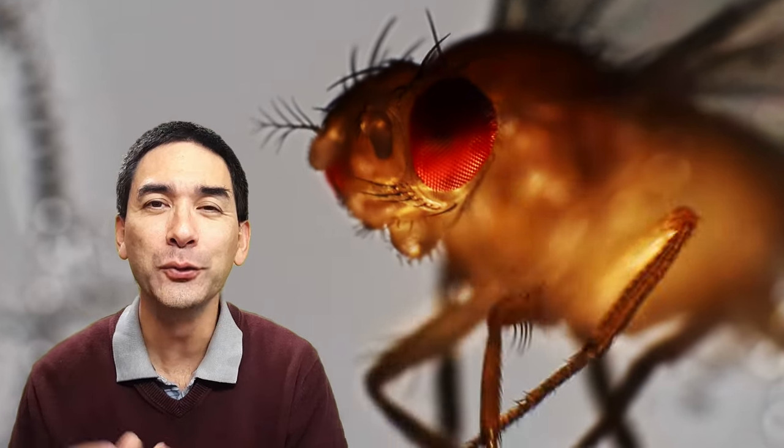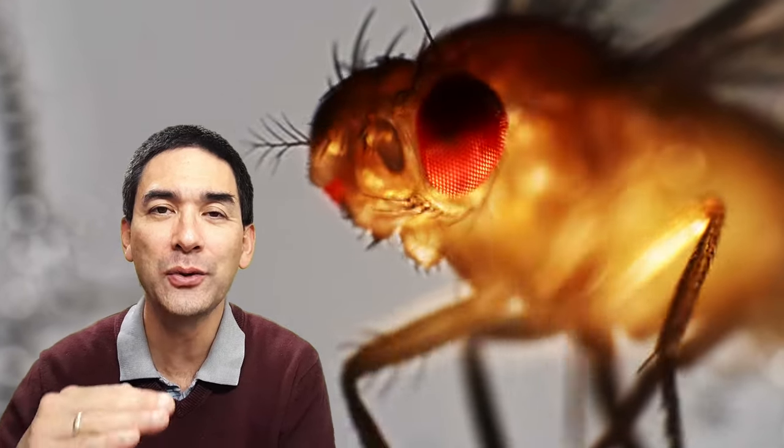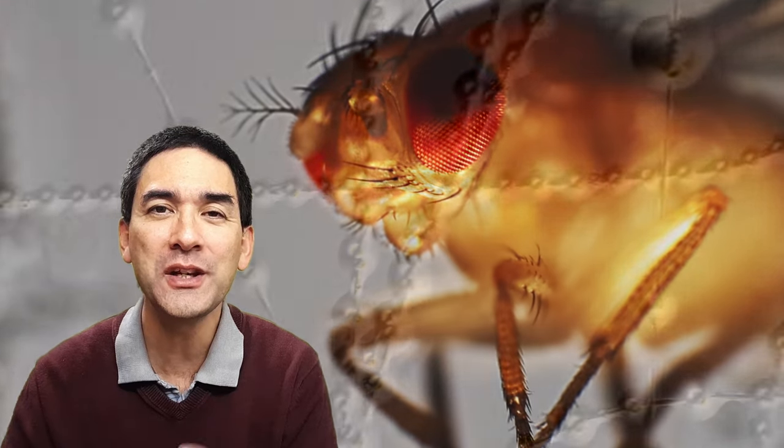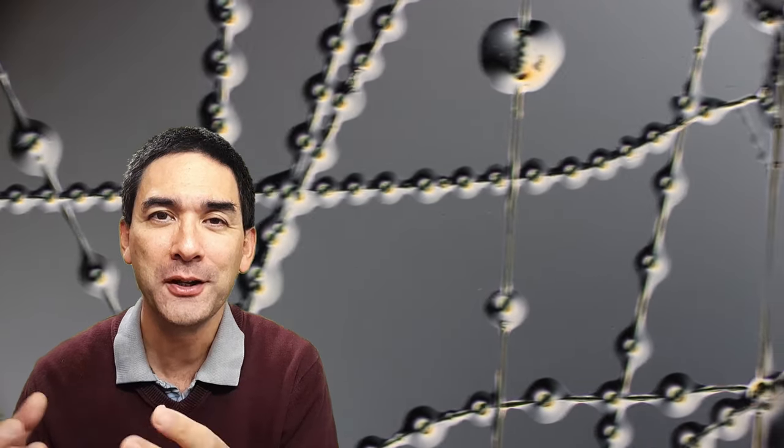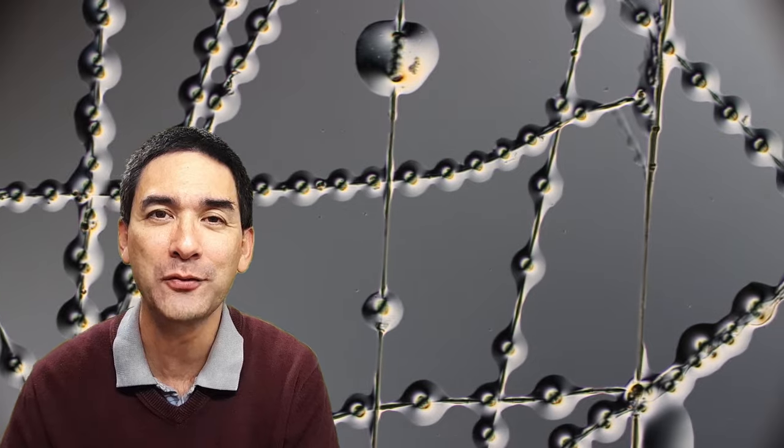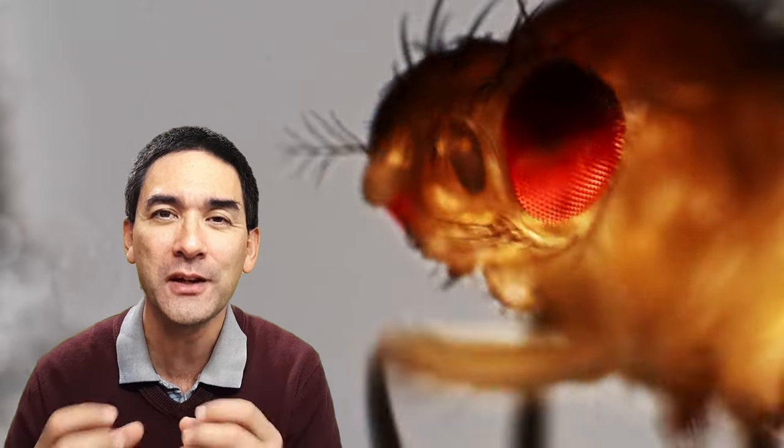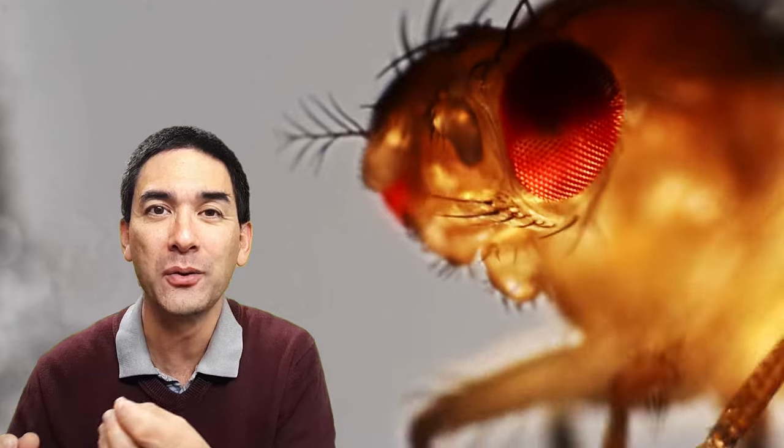This here is a tiny fruit fly which I stuck to a microscope slide using the web of a spider. Here this is a spider's web under the microscope. It is very sticky, very very sticky and I used the spider's web glue to connect the fruit fly with my microscope slide.